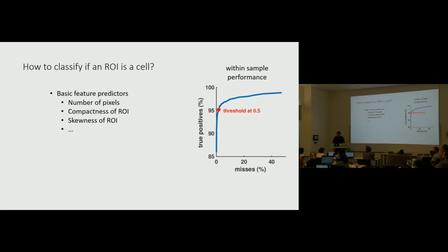So just to clarify, let's say there's a cell that has no transient at all, right? It will be ignored. Is that true? Yeah, if that cell has no correlation in its pixels, it will be ignored. Yes. What if that cell, say you had also a red channel going on, you still want it to somehow be considered as part of your data set? Is there a way to include it based on red, as a non-active red cell?